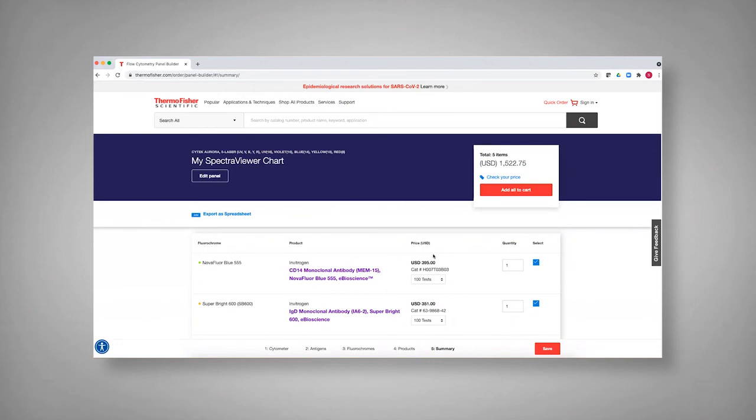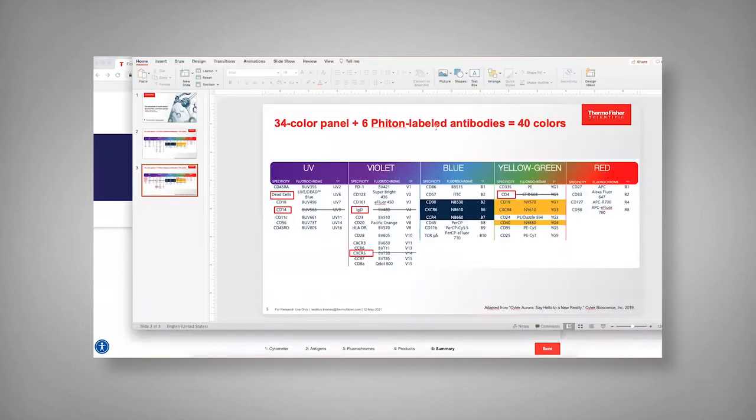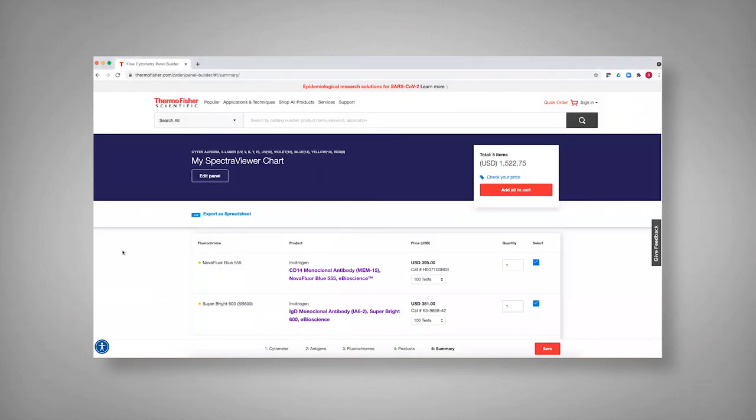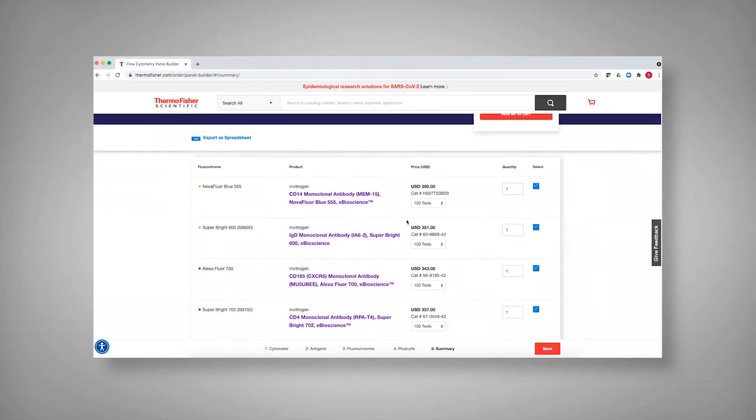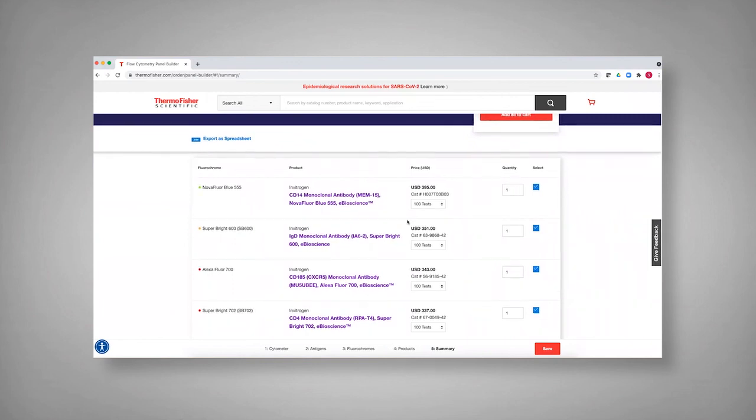And so with that, I think it's worth really thinking about some of these places where you are building into the panel design and really able to assess in a different way. So I still would recommend that you need to test where are the places that are of more spread. But this gives you the ability to really say, I've worked through my panel, I've tried to look at what is causing additional spread and where there aren't so many issues.